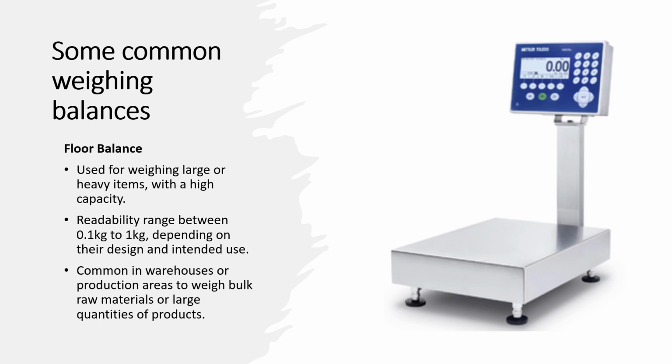A few examples of Mettler-Toledo balances are the PFA 589 models, and normally the operating range of such floor balances is 50 kilogram to 300 kilogram or 300 kilogram to 1000 kilograms. Again, it depends upon the model and requirement.